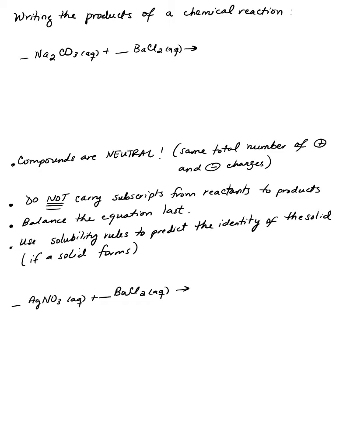Sometimes when you have a precipitation reaction, the solid that is formed will have a specific color, and that's a change in color, not in your solution, but you can actually observe the solid forming, and the solid can be white, yellow, orange, depending on the actual compound that you have. You can see the color for your solid.